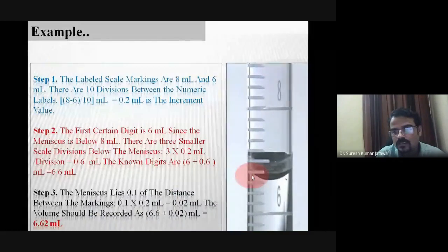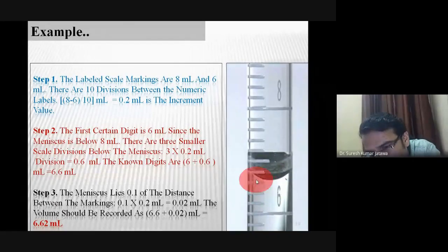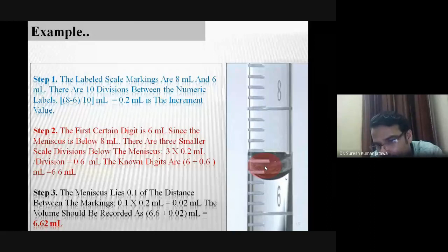Because the molecules in the solution sometimes attract with the glass surface. Like water, if you are preparing a solution in water, the water molecules attract strongly with the glassware, so your meniscus comes in a curved shape downward. In the same manner, with mercury and glass, it comes in a domed shape, because the molecules present in mercury have stronger bonding with each other apart from the glass.